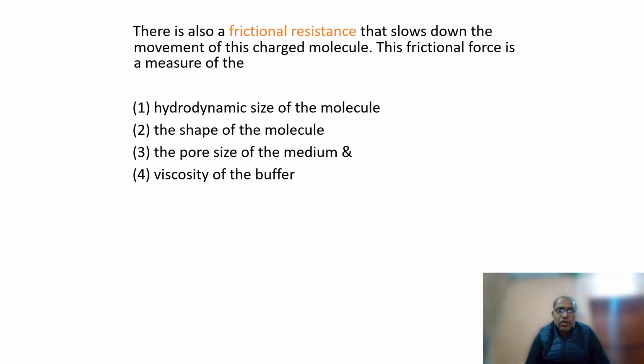Then the frictional resistance of the sieve will slow down the movement of charged molecules like DNA and protein. The frictional force is a measure of the hydrodynamic size of the molecule, the shape of the molecule, the pore size of the medium, and the viscosity of the buffer.